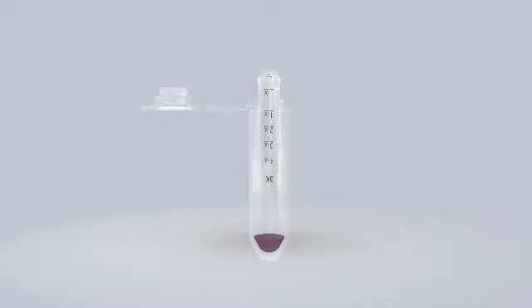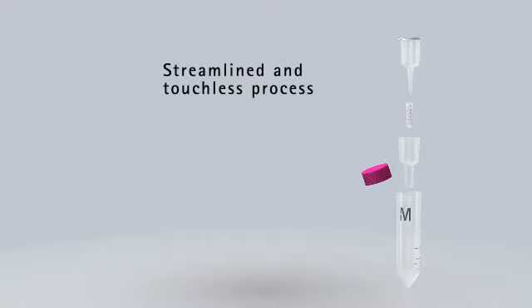With the Amicon Pro system, jump from lysate to pure protein without touching your sample. The Amicon Pro purification system streamlines the purification process without compromising yield or purity so you can get on with your research.